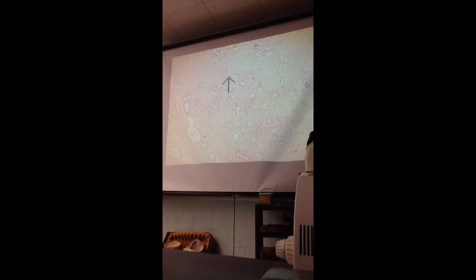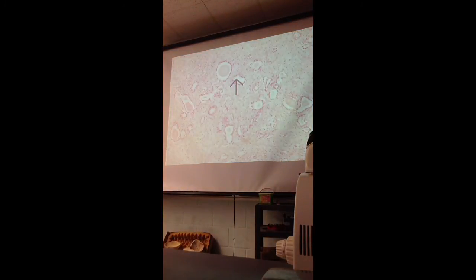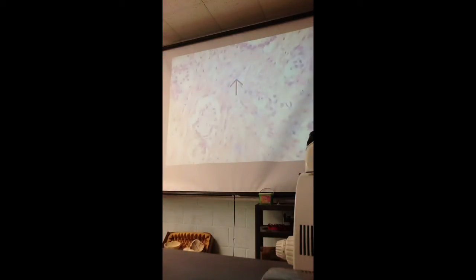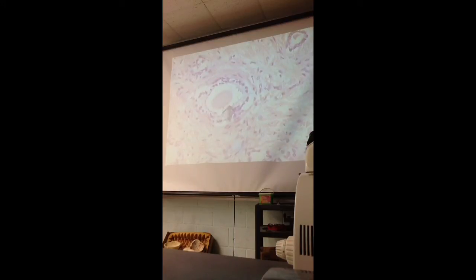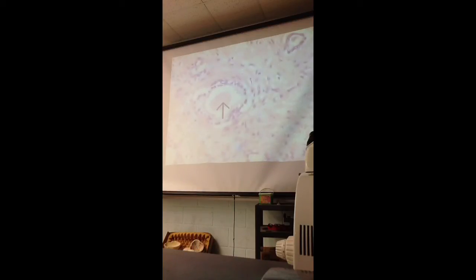Another best way to identify prostate is looking at these secretions. You see these secretions inside these tubules. When we zoom in, these are all the fibromuscular stroma. You can see some smooth muscles, some connective tissue cells, and the glands. Like I said, the epithelial cells in the prostate are mixed. You can see columnar cells and some cuboidal cells.